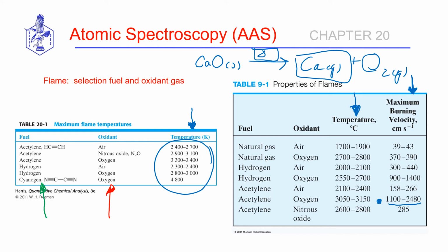So we want to avoid explosions in our chamber. You just need to make sure your flow rates are such that you don't risk this happening. These instruments come with a lot of safeguards that pretty much don't allow you to have settings in which this is a possibility. This is just one of the advances made in instrumentation over the years.